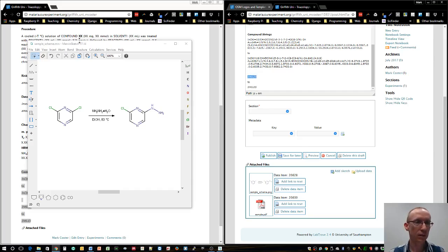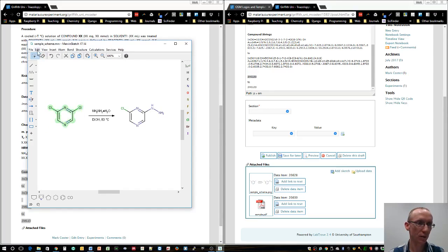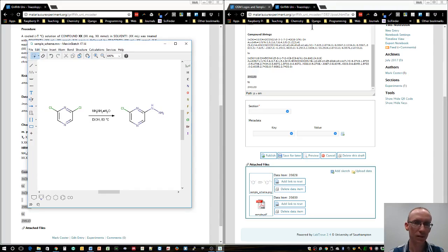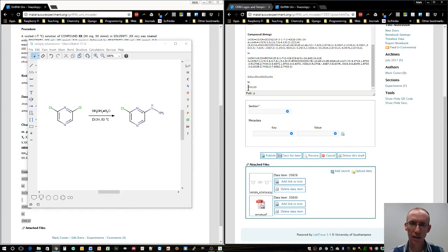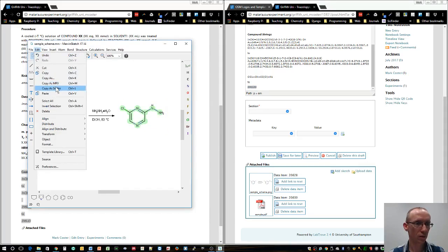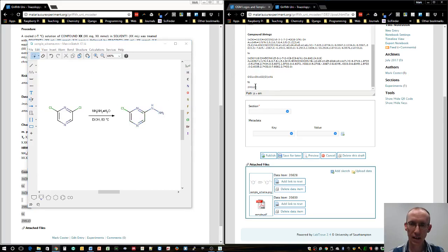We'll select that, go back to Marvin, and select the first molecule, the starting material, and say copy as SMILES. Go back over here and paste, and then go to the second molecule, copy as SMILES, and paste that into the bottom there.